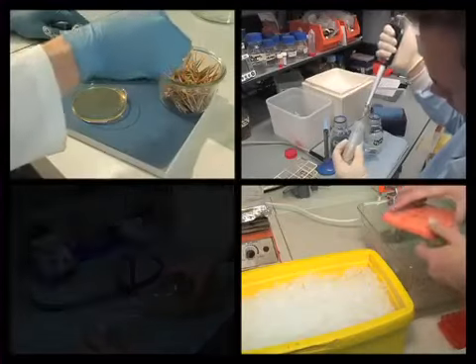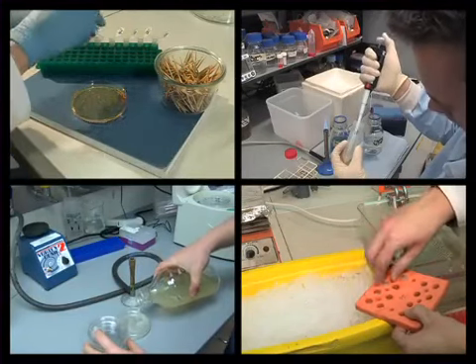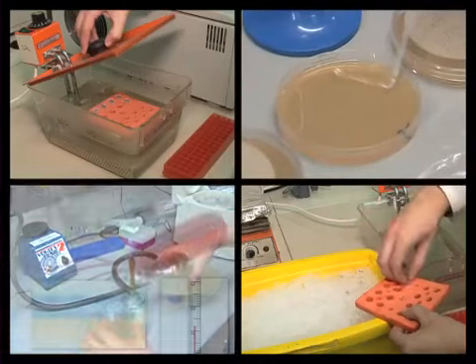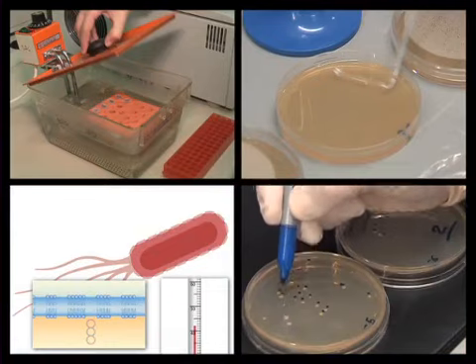You've just watched Joe's introduction to heat shock transformation. In this video, we reviewed what heat shock transformation is and how it works, the principle behind it, and how to successfully transform bacteria.